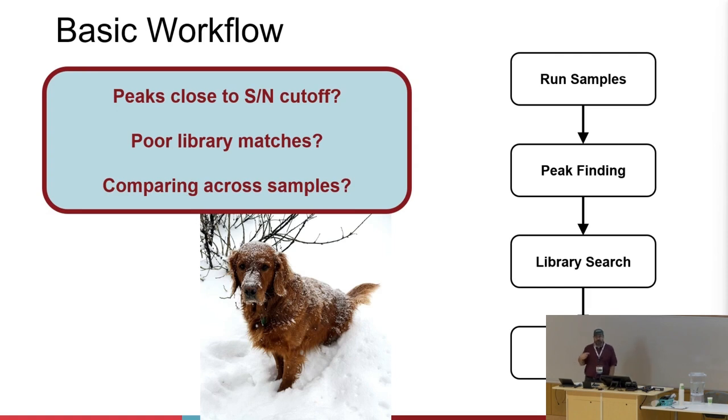And there are a lot of tools that people are developing, and some are coming into commercial software. There's a ton of lab-based custom solutions that people have. But one of the things I want to work with my students, because most of them don't want to code, sadly, is working with a workflow that uses tools that we already have in the software. We don't have to write a bunch of special code on our own. If we want to, we can, great. But if you don't want to, you can just use the tools that are in the software.